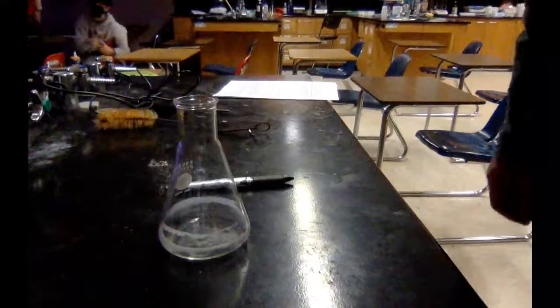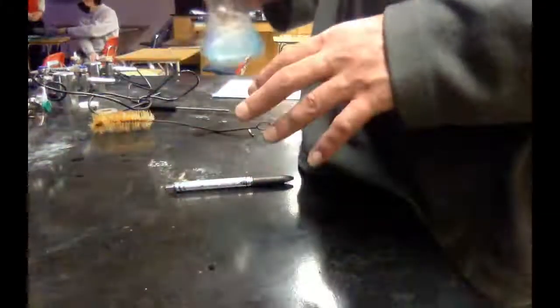So, this is an Erlenmeyer flask, right? The thing about this is everything has to be completely clean. Otherwise, you're going to end up wasting a bunch of time because the reaction will start to take place if everything's not clean. If you sit there and you're making these chemicals and the reaction starts taking place and you're not paying attention, then obviously you're not going to get done, right? Does that make sense? So you need to make sure you clean everything out real good. This is extra dirty. Let's try that again.